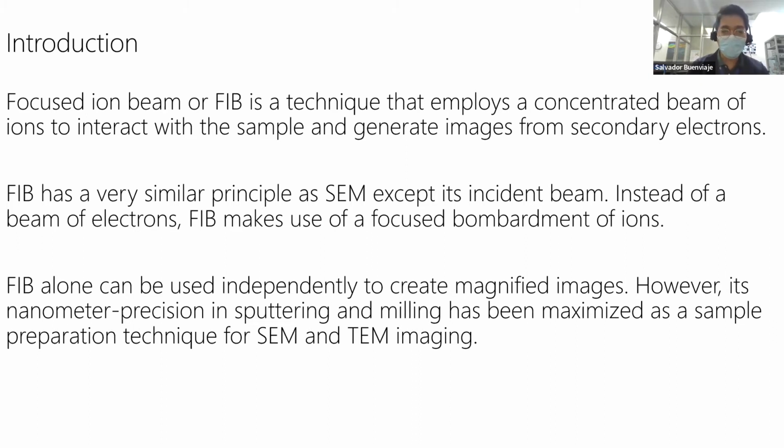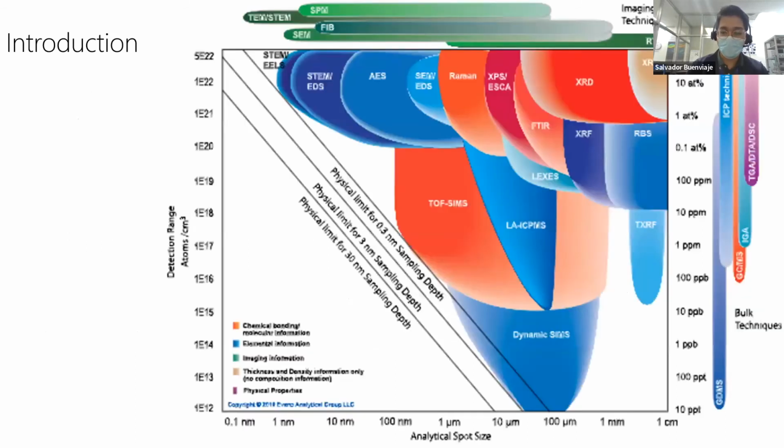So usually, FIB is not used as a standalone equipment or tool. It is usually connected to a SEM or TEM. So the use of FIB is actually more on the sample preparation, as you will see here.